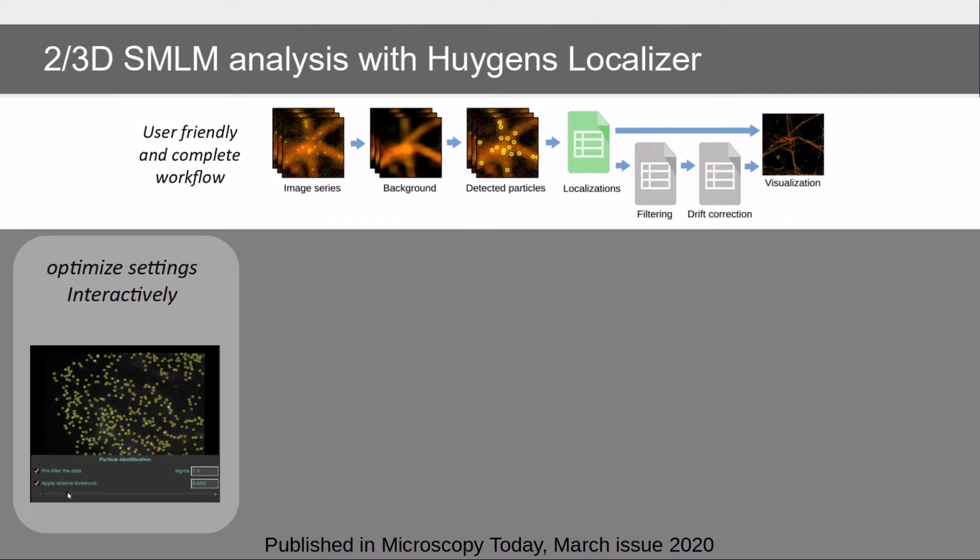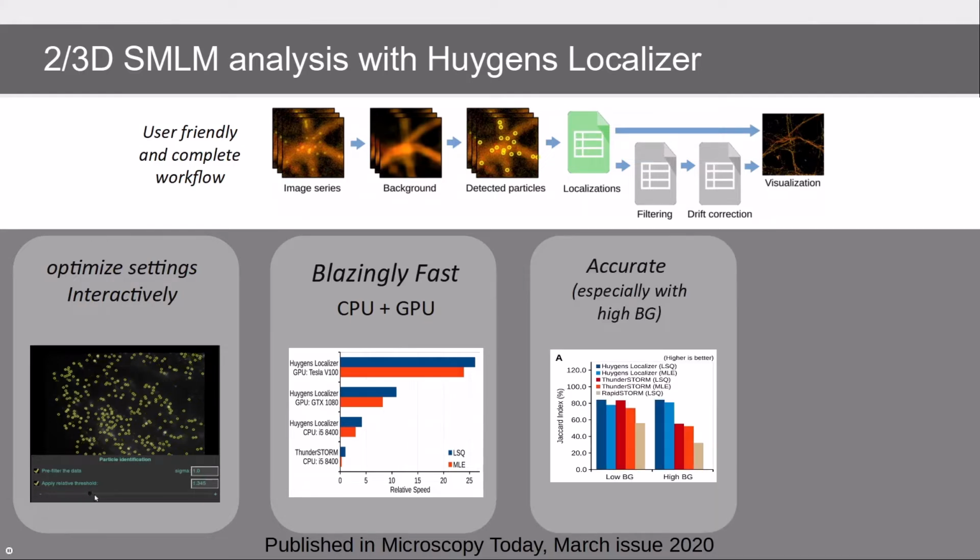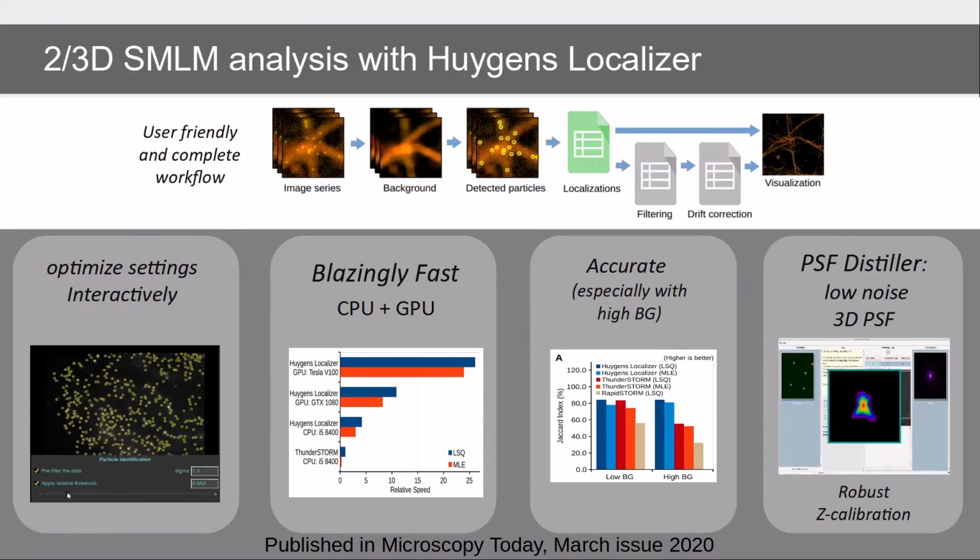The workflow is very user-friendly, allowing you to optimize the settings interactively. The process is also very fast, especially on the GPU, and it's very accurate even with high background noise. Finally, it contains a PSF distiller for Z calibration in 3D localization.